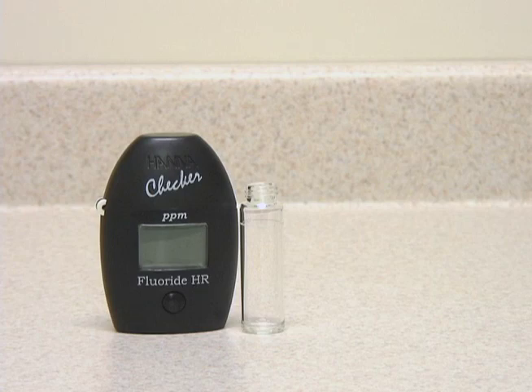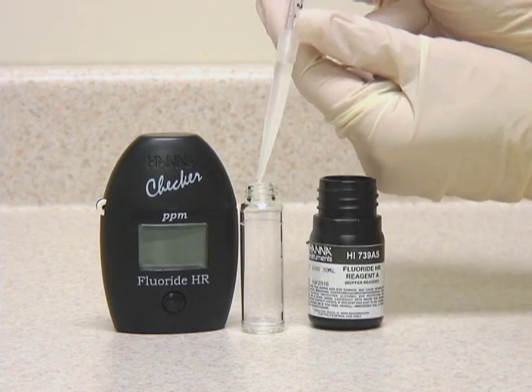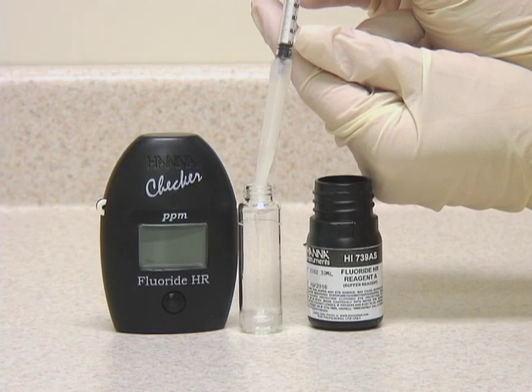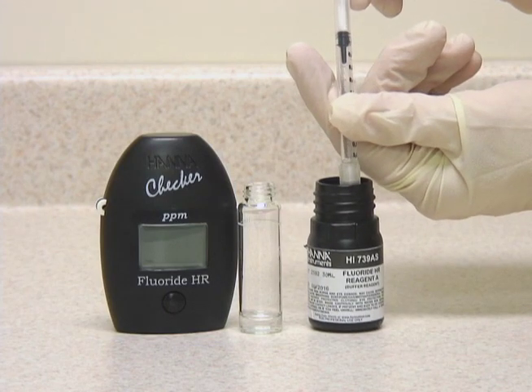Today we're going to run a test with the HI739 high-range fluoride meter. To perform this test, first we take our reagent A, and we're going to add two milliliters of this reagent to our sample vial. It's important to use the tips when you're using these syringes for best accuracy.